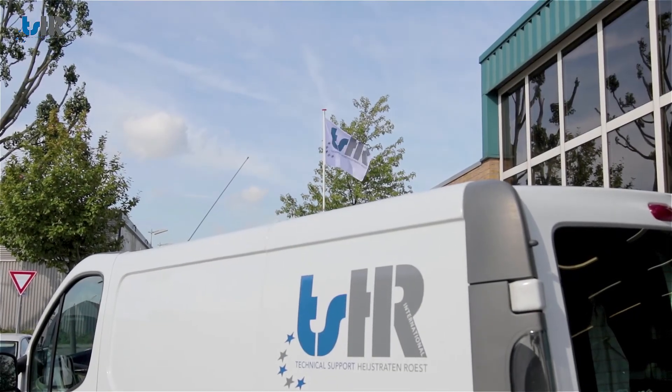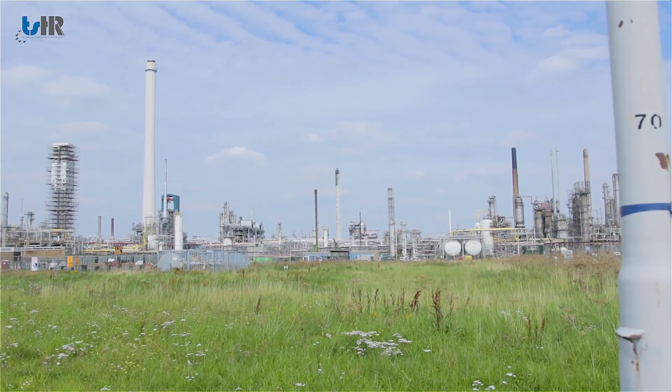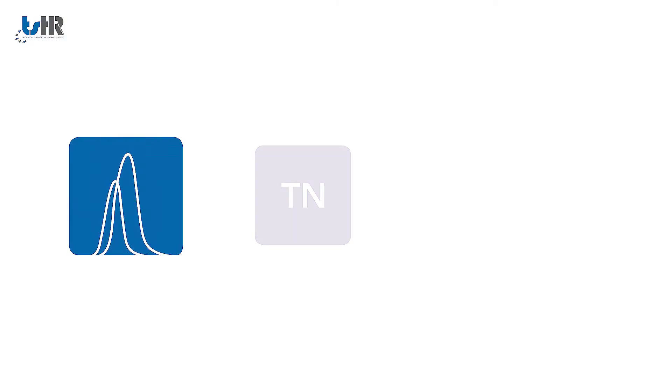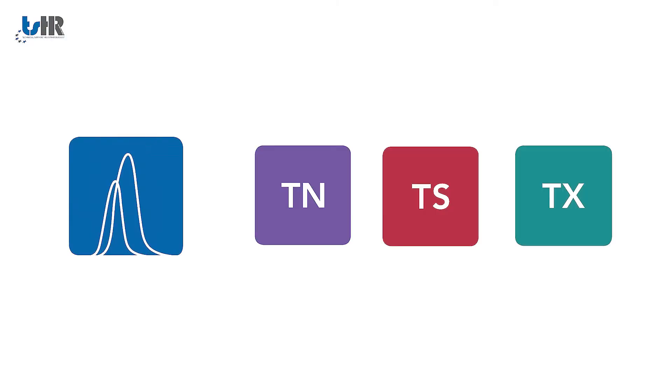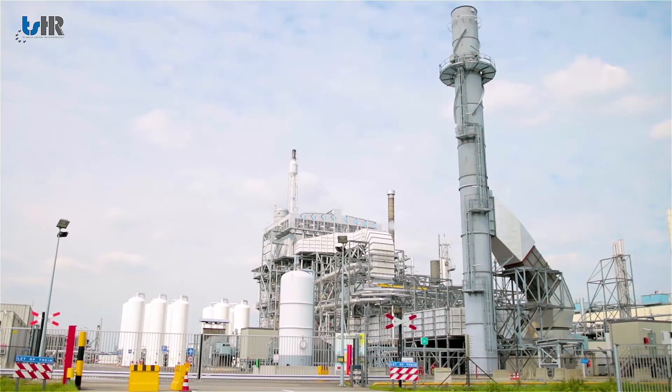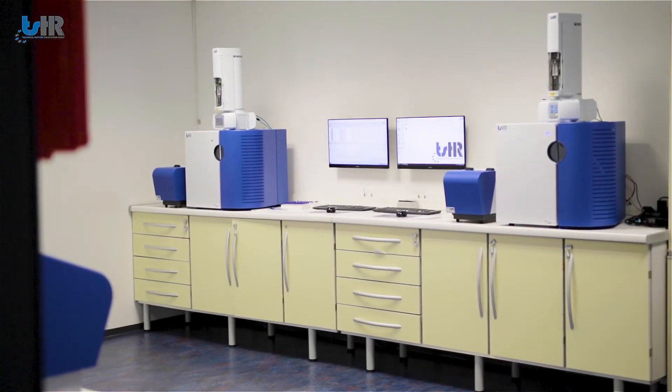TSHR International is a leading manufacturer of combustion elemental analyzers for the trace level analysis of total nitrogen, sulfur and chlorine in an extended range of petroleum and hydrocarbon products.